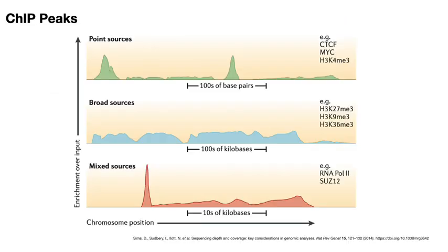Okay, now let's talk about actual peaks. There are several kinds of peaks. There are narrow peaks, which we can also call point sources, which are primarily transcription factors and have small ranges in the 50 to 100 base pair range. On the contrary, broad peaks from chromatin modifiers are large and can span across long ranges of DNA. So, identifying the type of peak is now going to be an important step in generating the library and performing the ChIP-seq analysis.